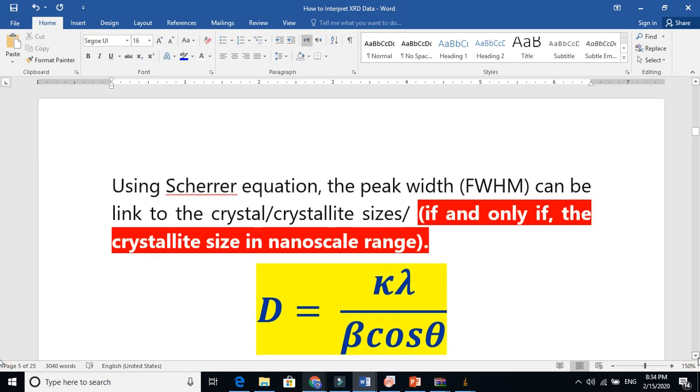We use Scherrer equation to link this full width half maxima to the crystallite size. From the full width at half maxima value, we can understand and estimate what is the crystallite size.